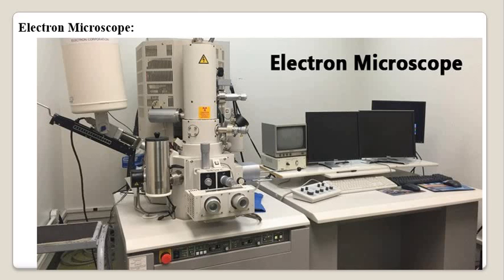Now in the electron microscope, what is that? The electron beam passes through the condenser coil and then falls on the object. The electrons get scattered or transmitted through the object and pass through the objective coil, which magnifies the image of the object. The projector coil further magnifies the image and projects it on the fluorescent screen or the photographic screen.